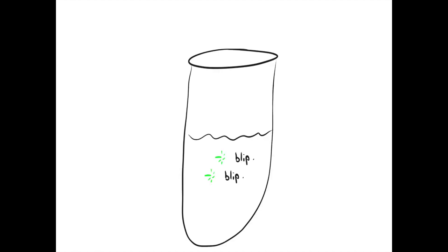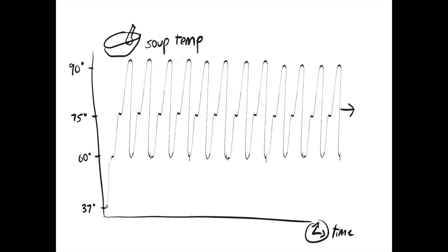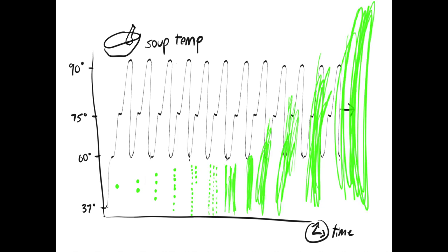You know what's more extreme than doing something once or twice? Doing it again and again and again. So we've done this now like 40 times. Each cycle that we do this, we cause twice as many blips of light as the last time. And so our little optical receptor can pick up this exponentially increasing degree of light release.